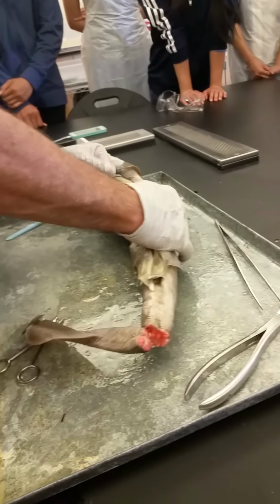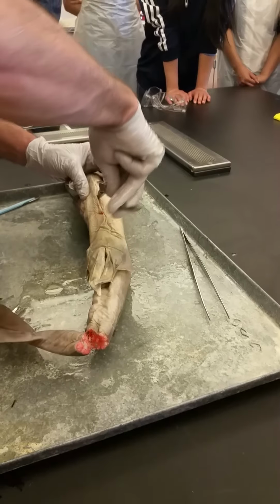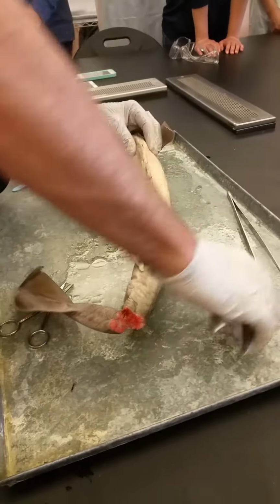Okay, so let's see if we can get in. These things have really tough skin.